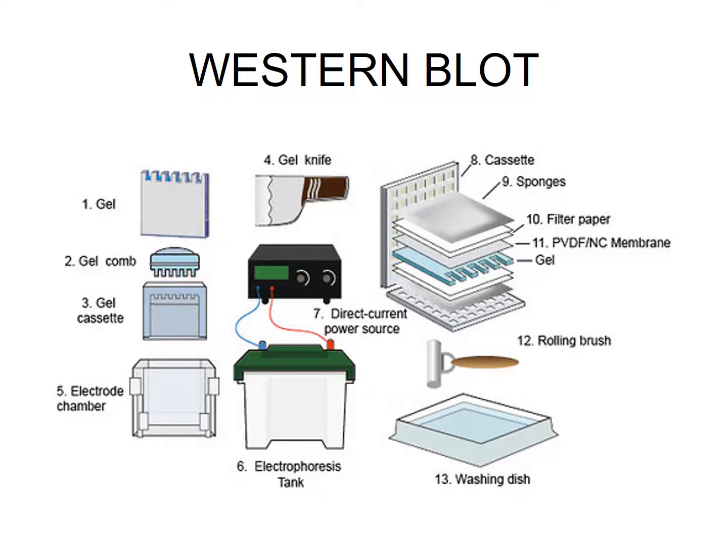So that can be SDS-PAGE, remember our friend SDS-PAGE, we talked about 1D and 2D electrophoresis. So this gel could be a 1D or 2D gel.